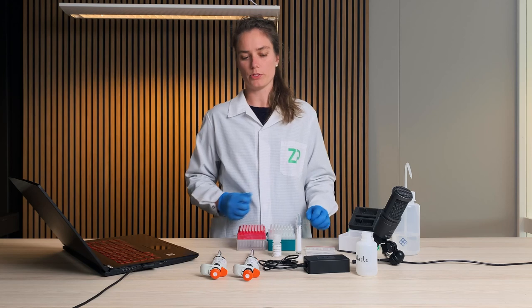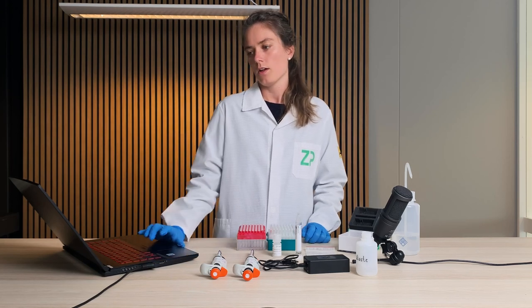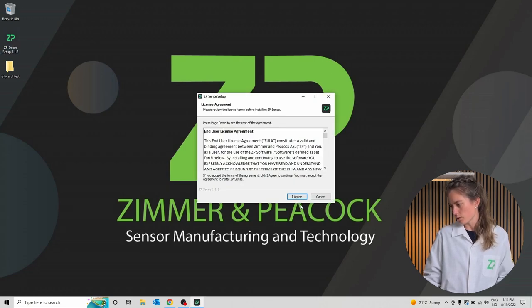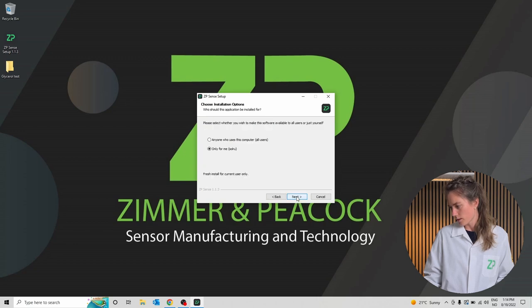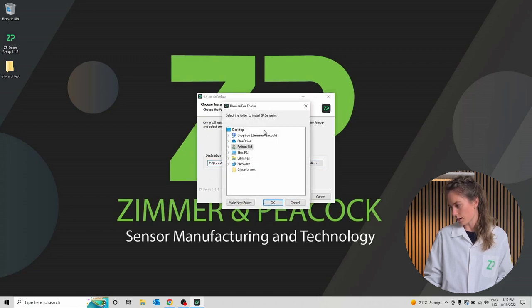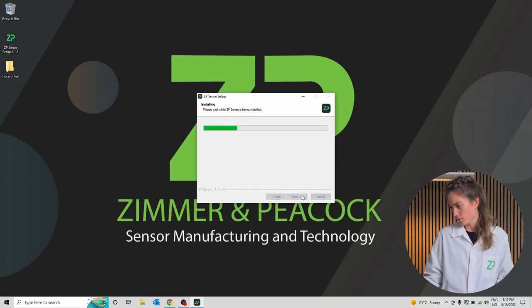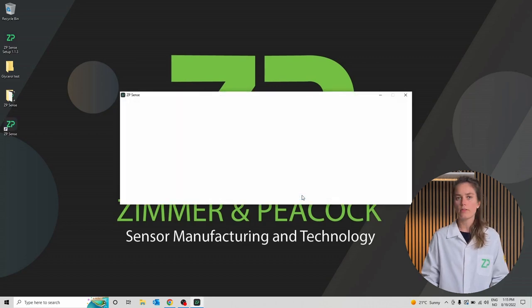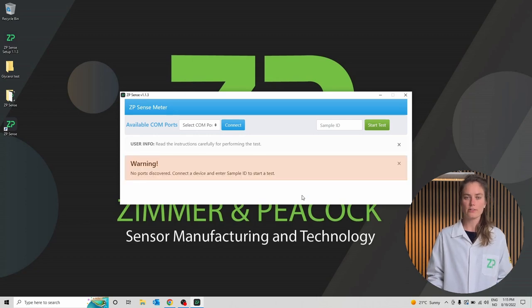We will start by installing the software on the computer. I will double click this icon, agree to the license agreement, click next, and install it on my desktop. I'll click finish and now the application is automatically starting to run.